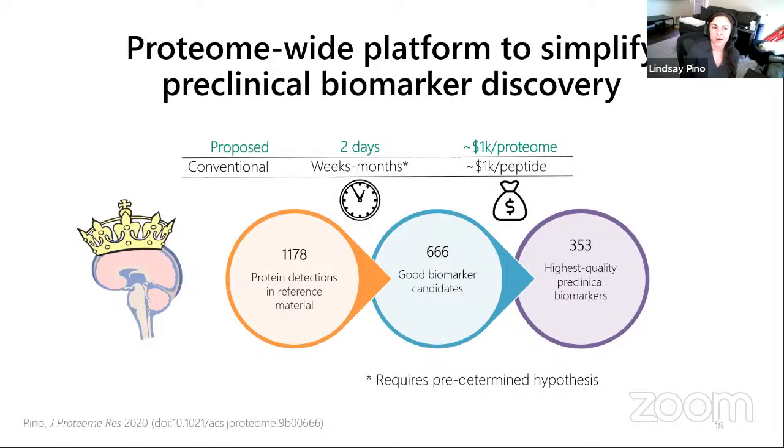Like a top 1 or a top 3 or a top n, just summing everything up or taking the average. There are some more intelligent ways of doing this that MSstats takes into consideration, but that does not include specific LOQ values.